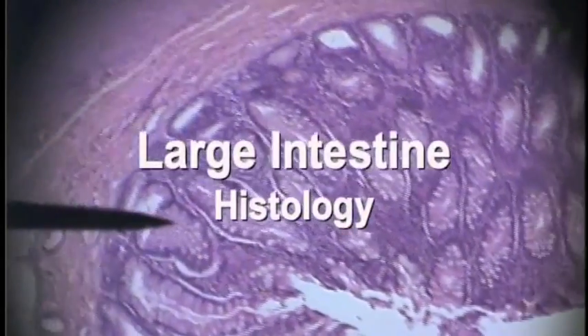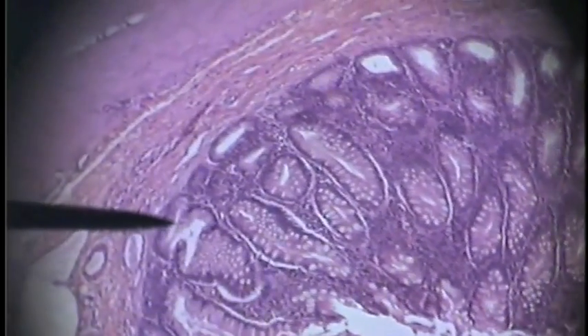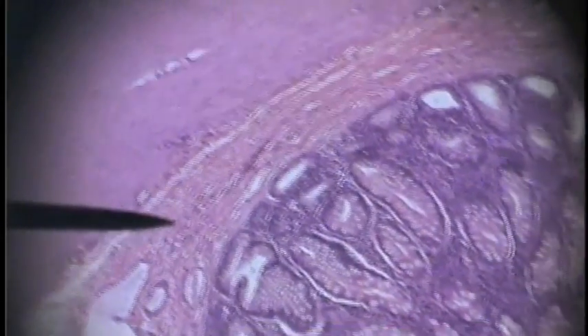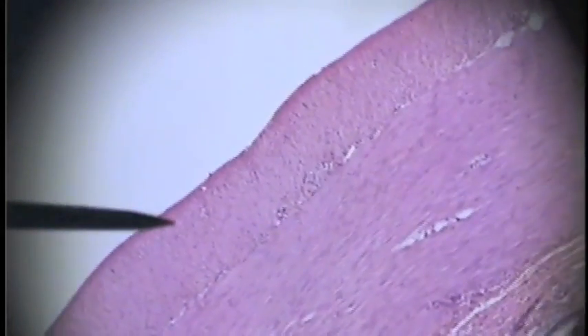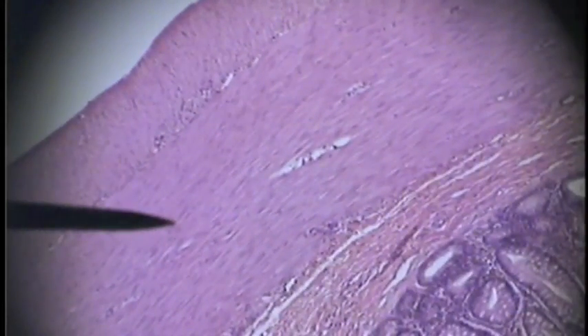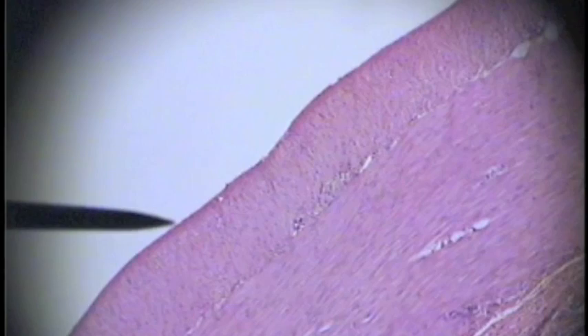We are now looking at the tunica mucosa of the large intestine. Now we see the tunica submucosa. Here is the tunica muscularis with the circular layer and the longitudinal layer. The tunica cirrosa here.